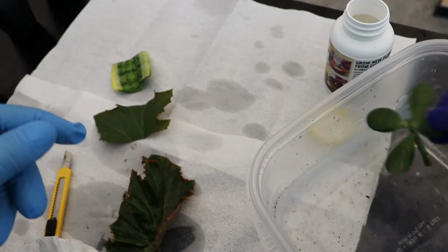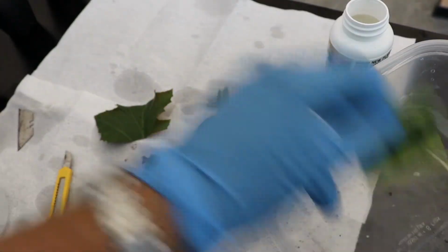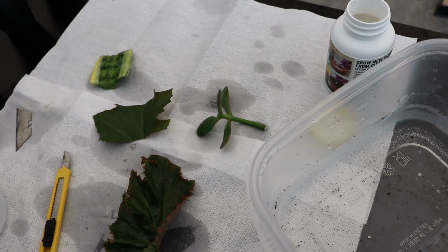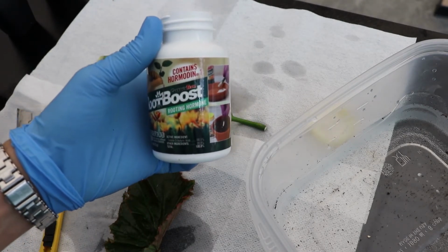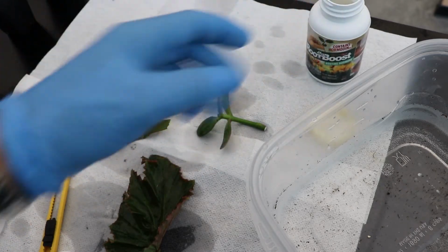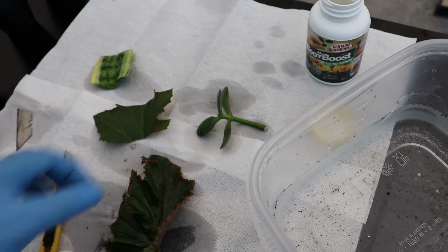All of our tip or stem cuttings, all of these are good if we can remove as many surface contaminants as possible. So while those are drying, it's also a time that you could consider having some kind of a rooting hormone if you wanted to bring in the discussion about plant hormones. This is an IBA, so it's synthetic auxin. So there are lots of additional types of facets that you can bring into this discussion.